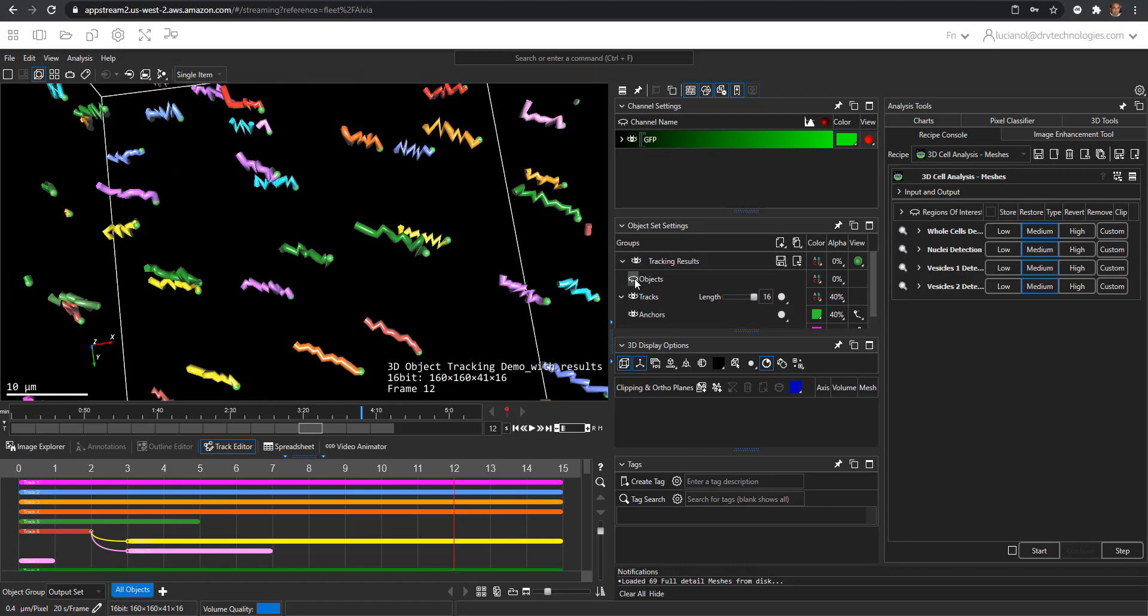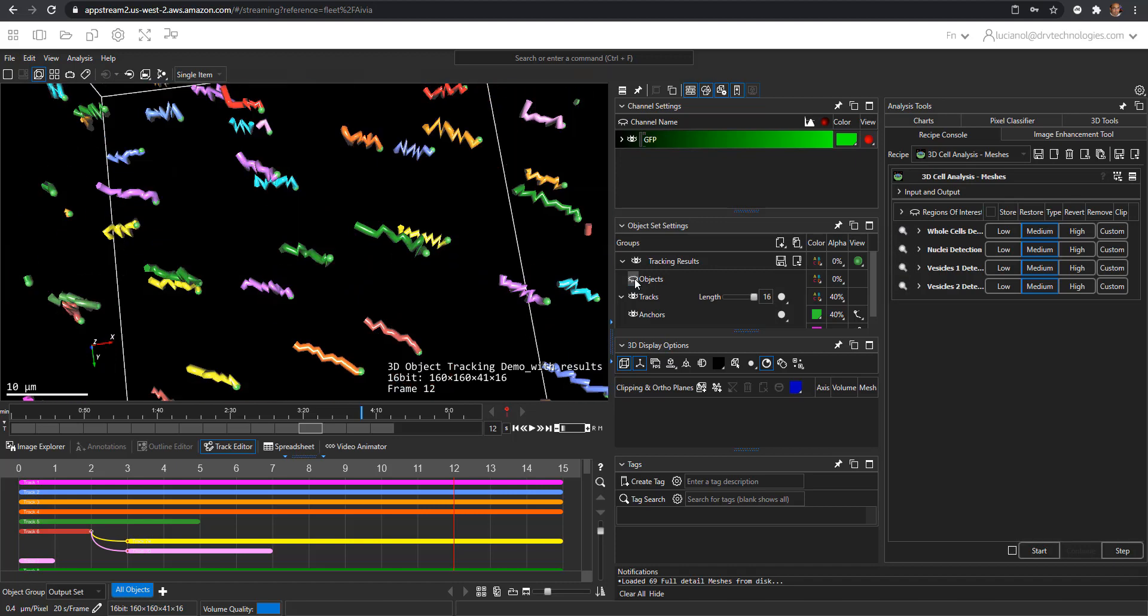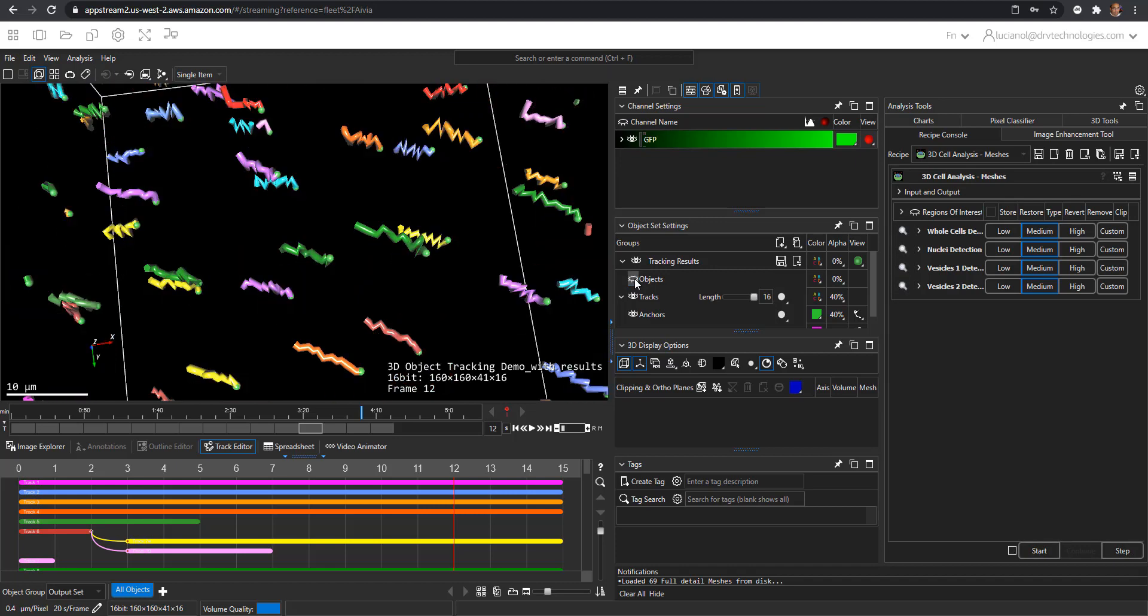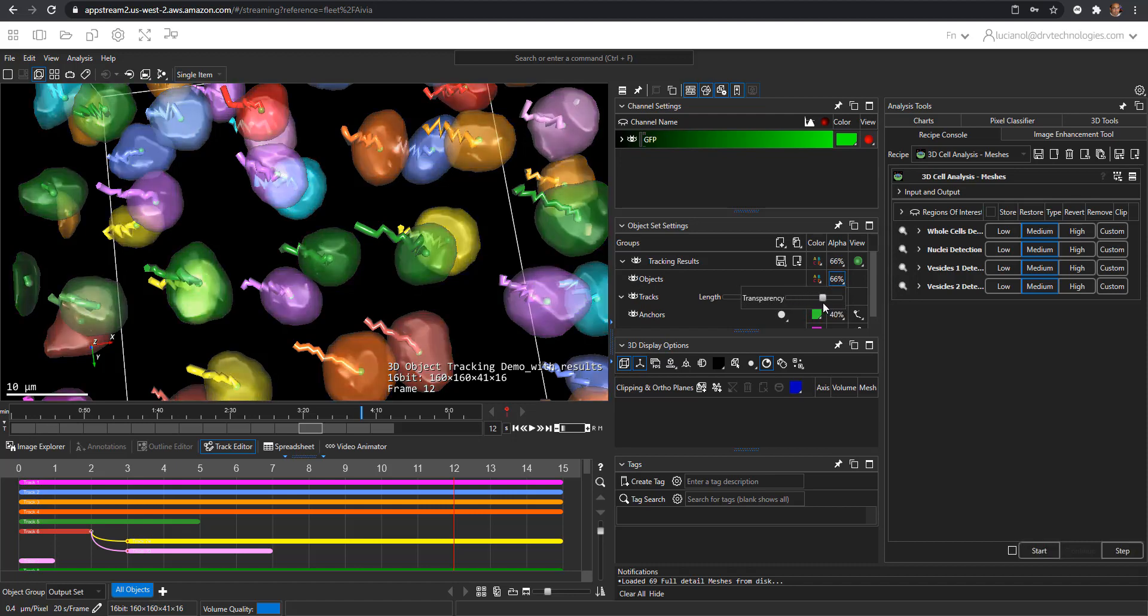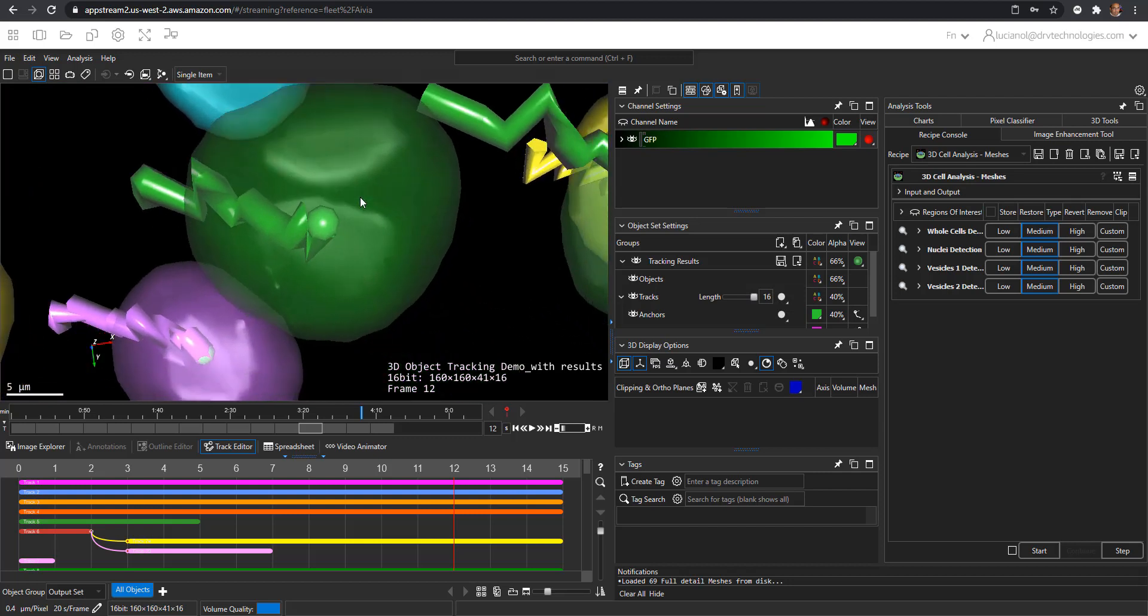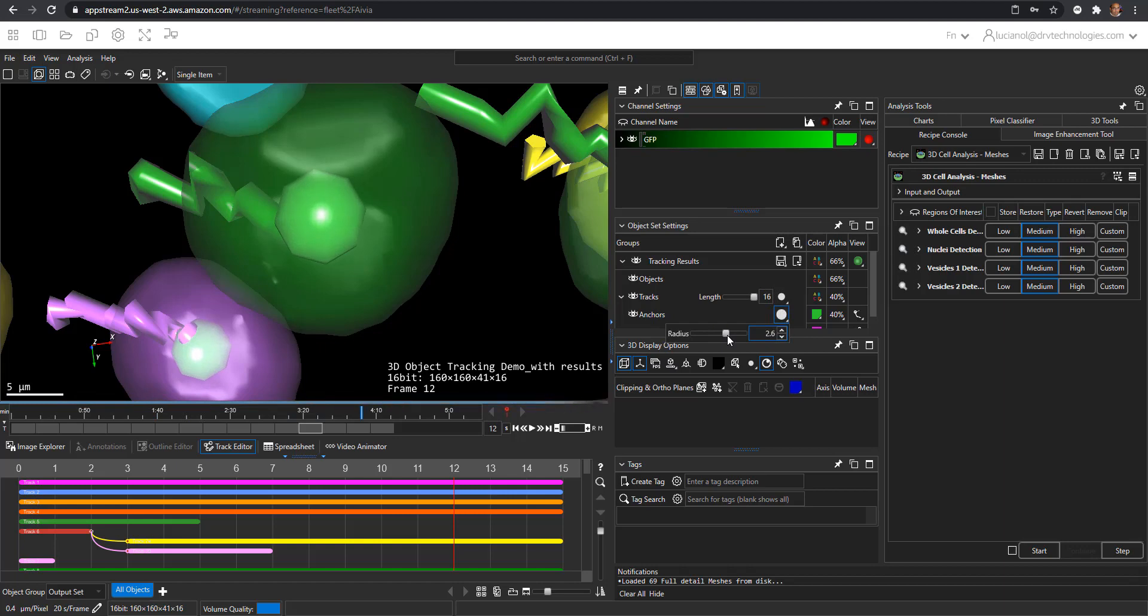I can turn on and off the objects right here. You can also make them semi-transparent so I can look through and see the center points. Center points are now visible. In Avia they are called anchors. You can also make these bigger and smaller using this control.